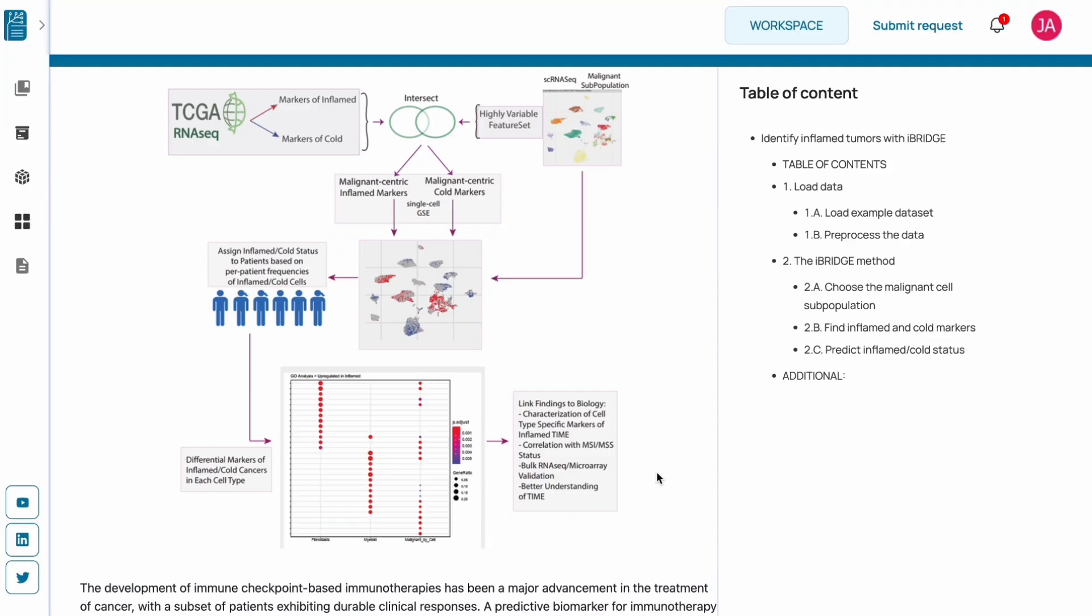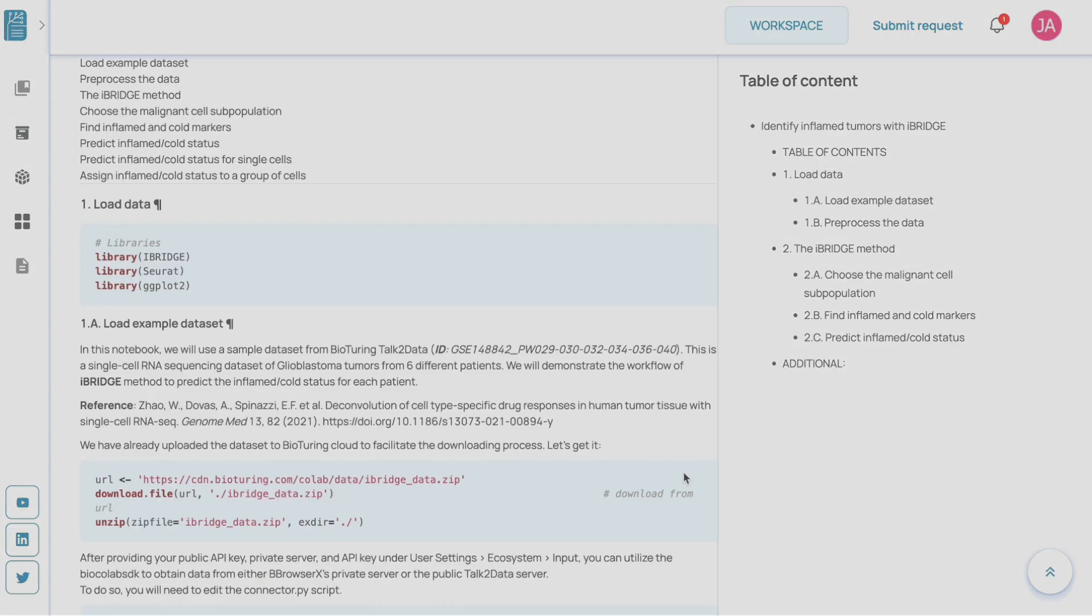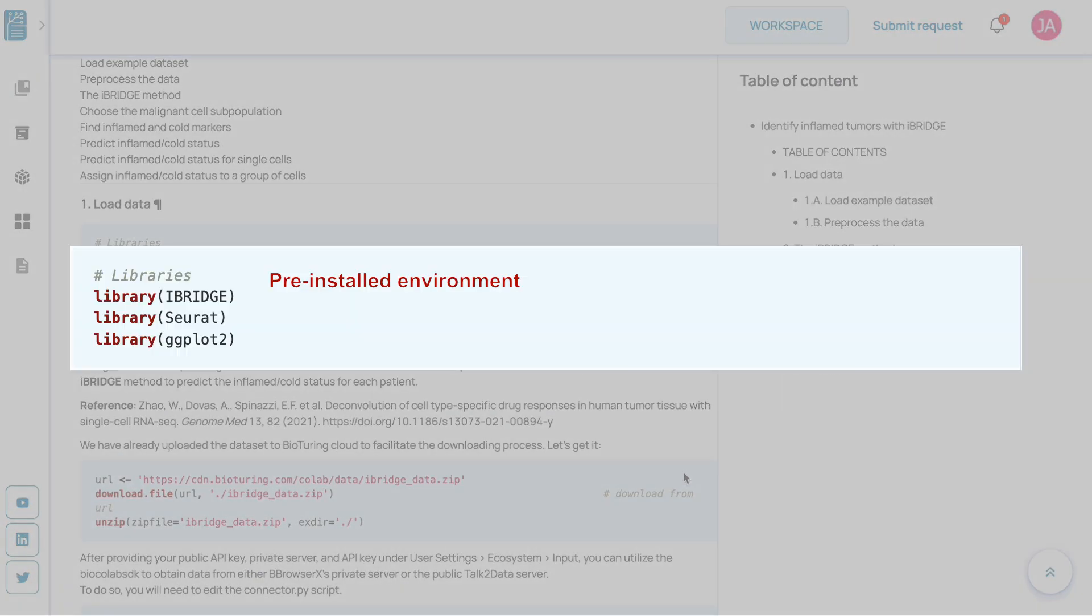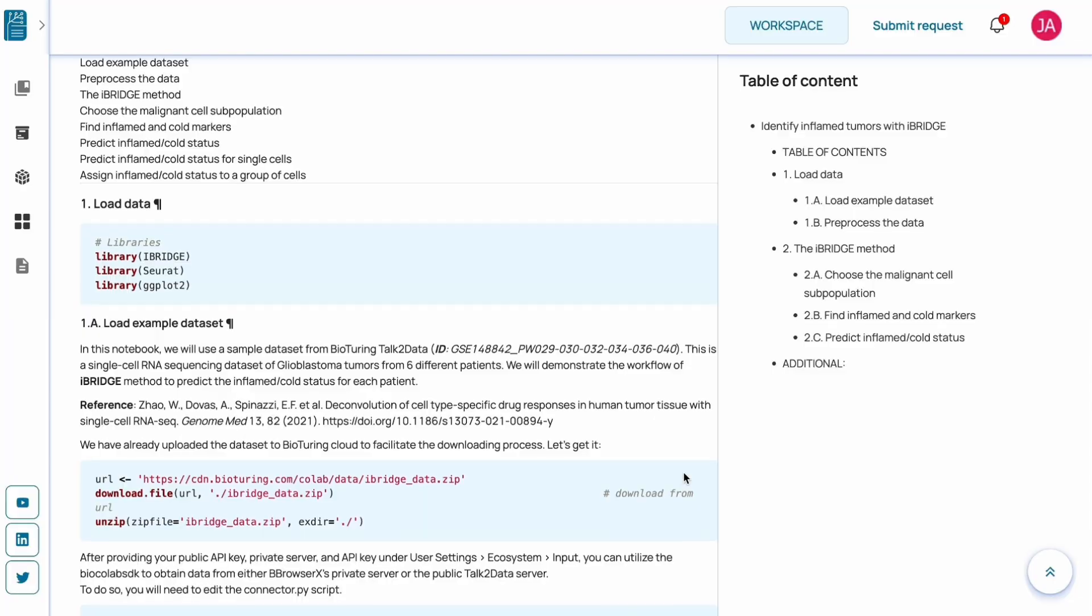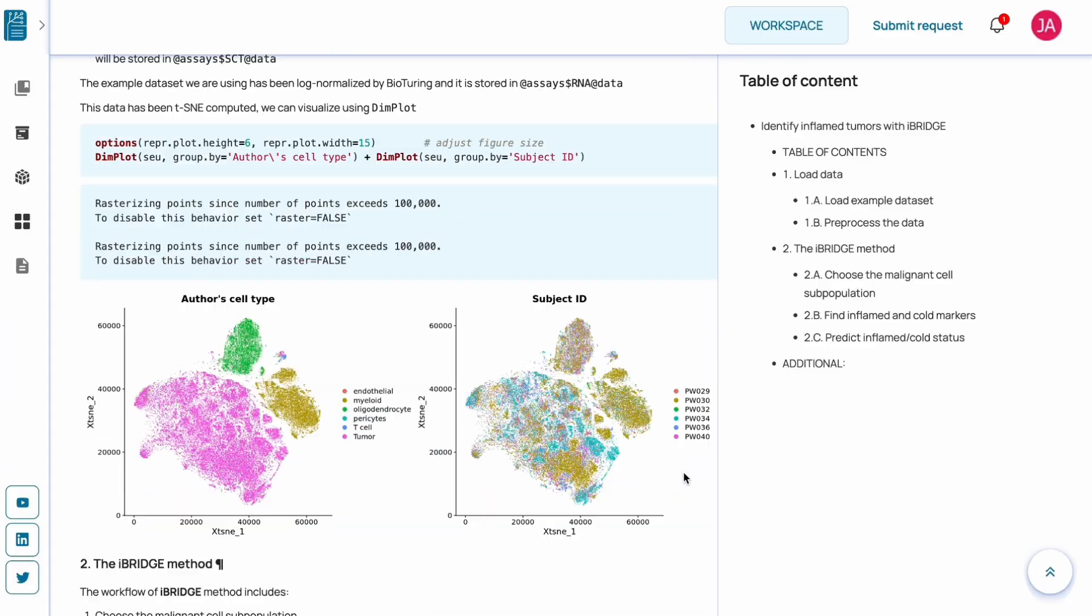Each notebook is prepared with pre-installed environments, complete with executable code examples.